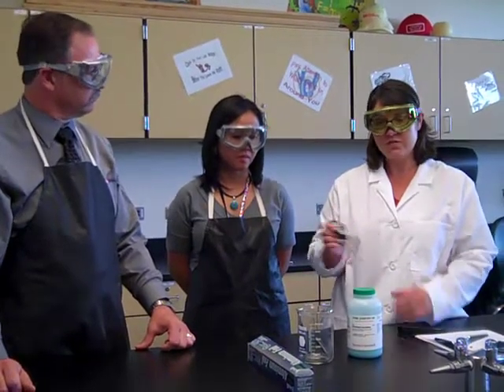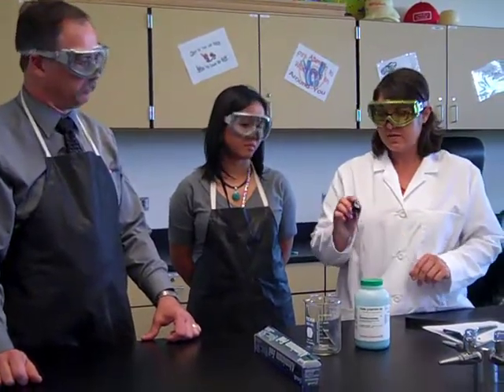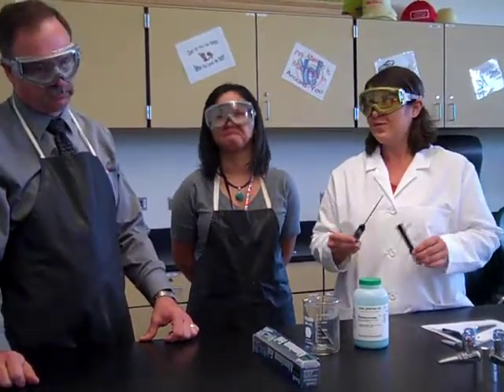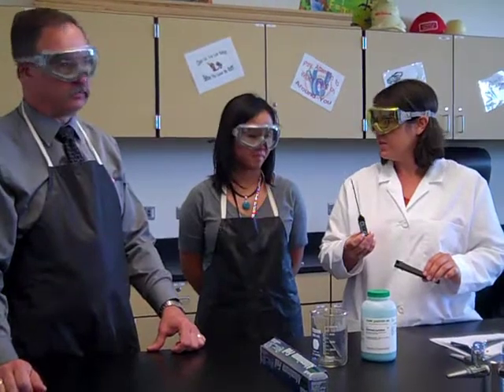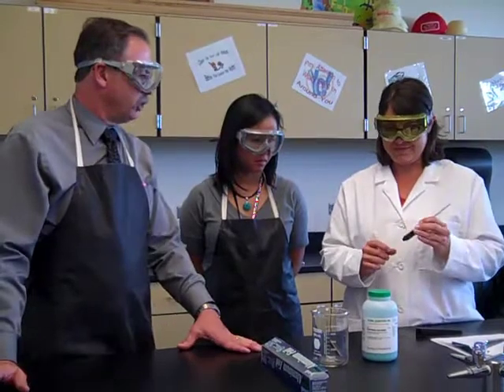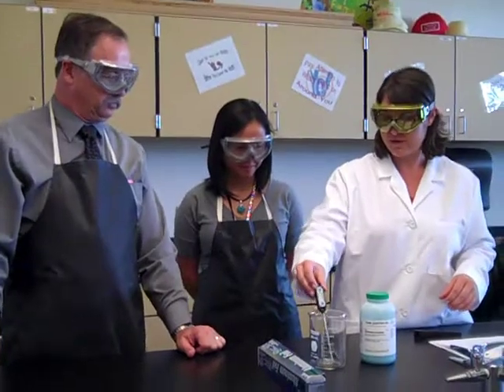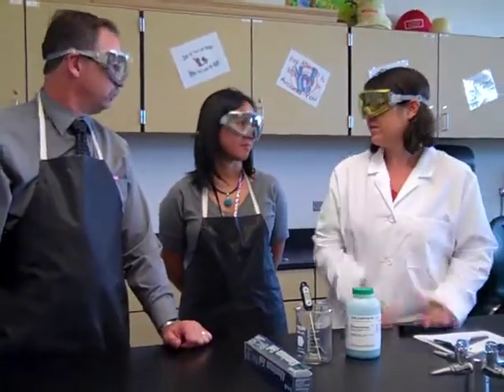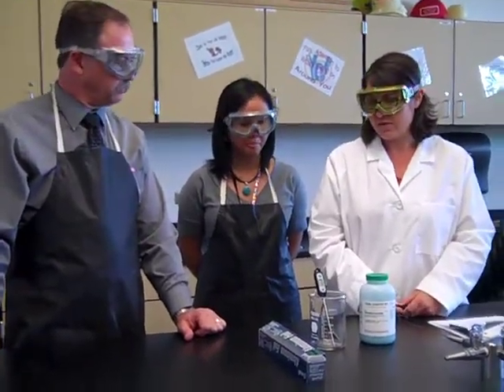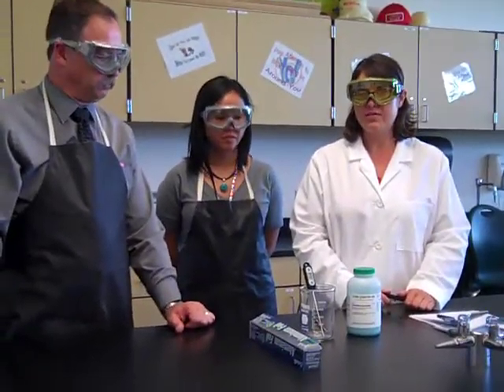Once you've got the powder dissolved in water, that's just a physical change. Take the temperature — make sure you take the cover off the thermometer, it works better that way — and measure in Celsius, making sure it's on the right setting. Take the before temperature, then start a timer. Every 30 seconds, take a temperature reading and graph the results.